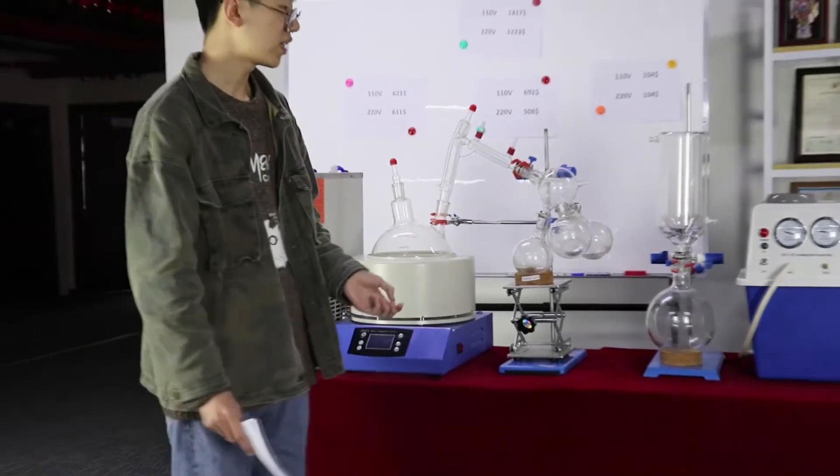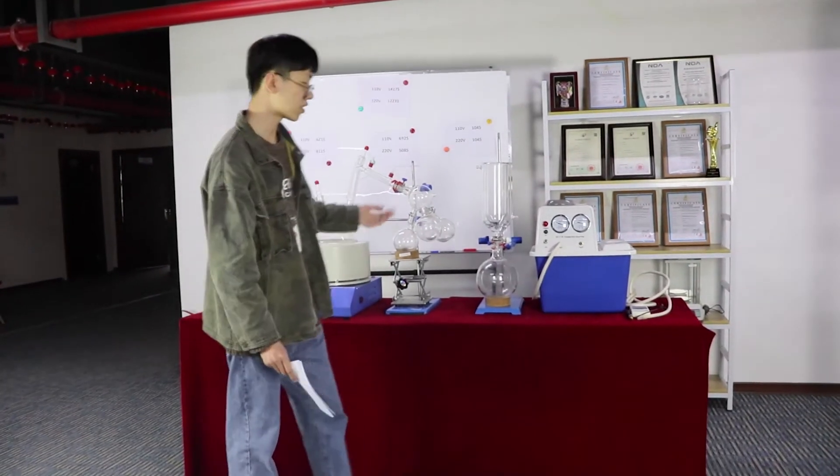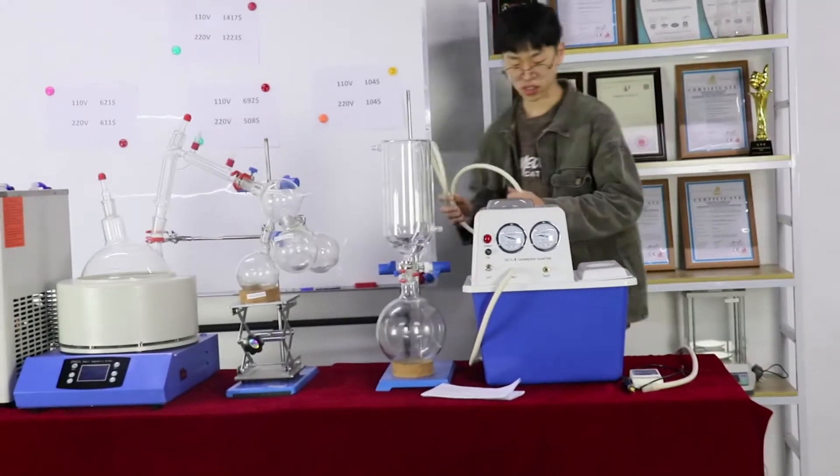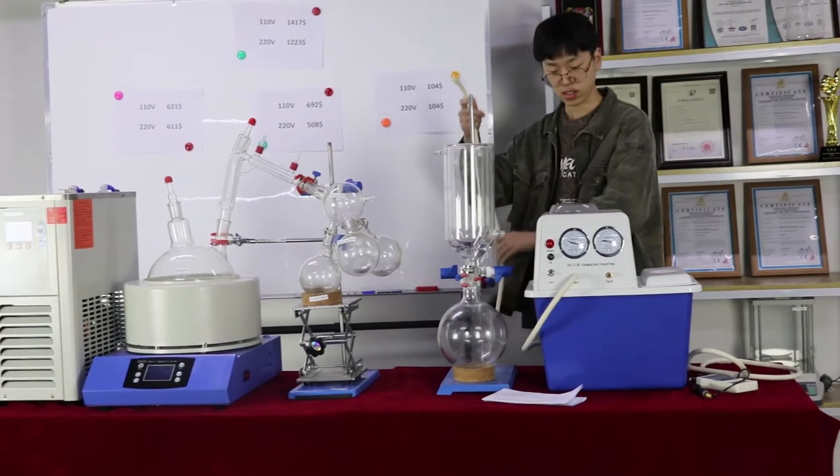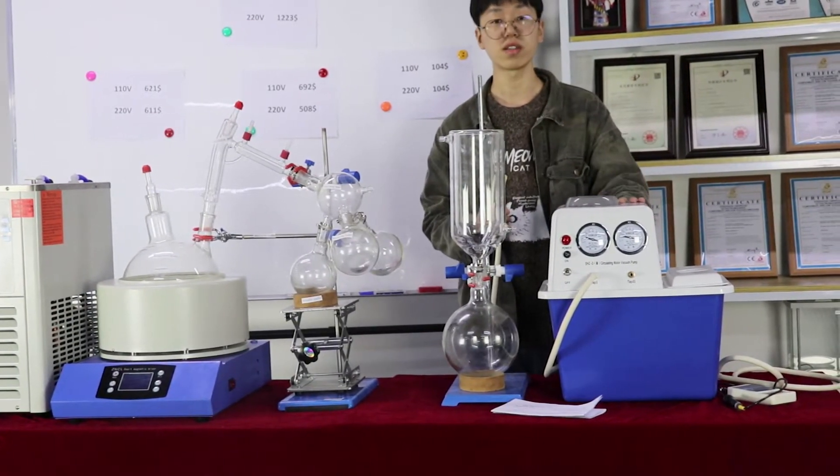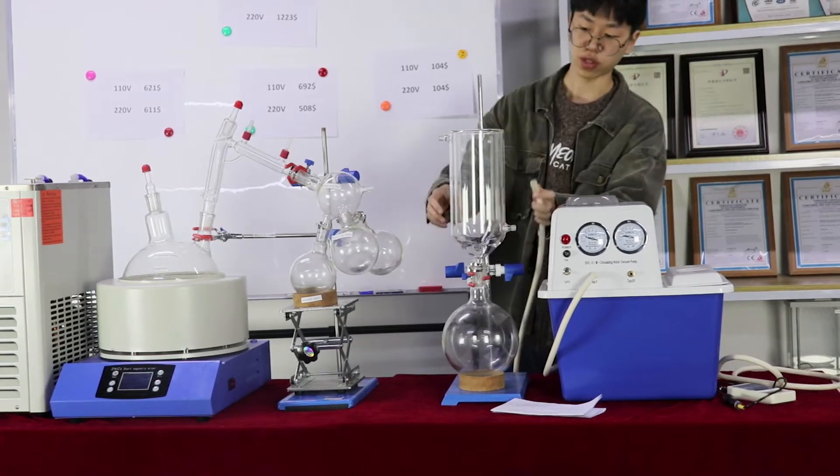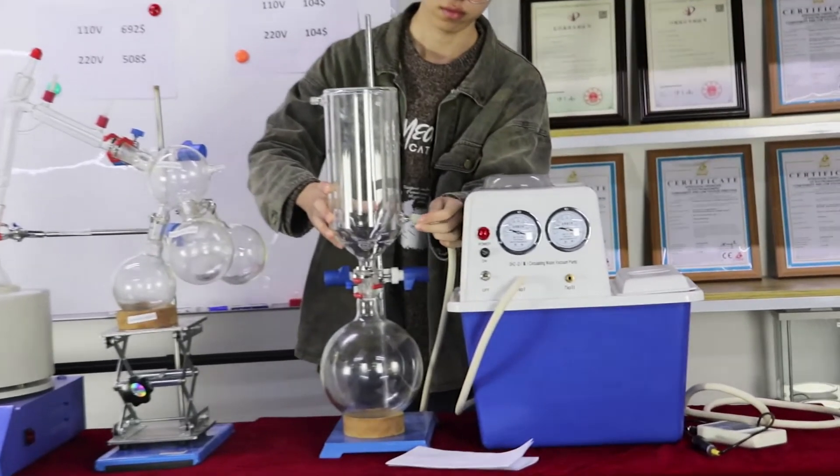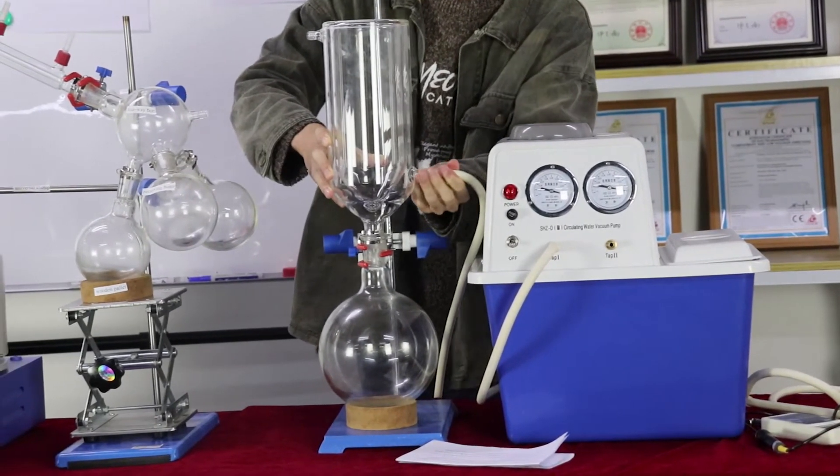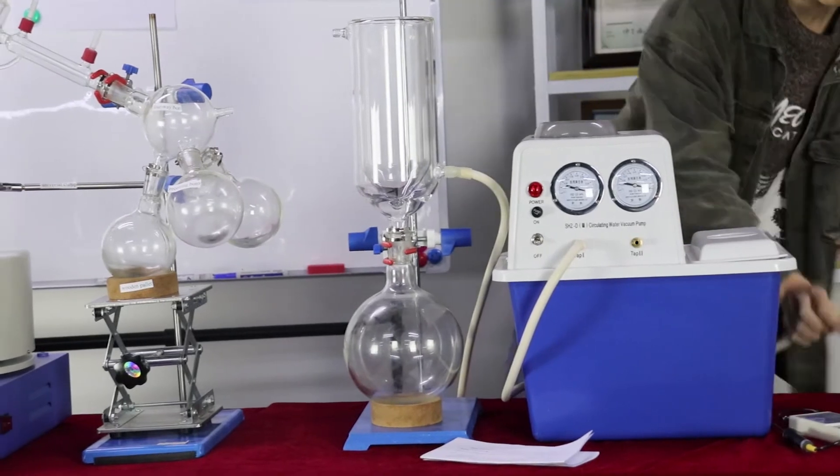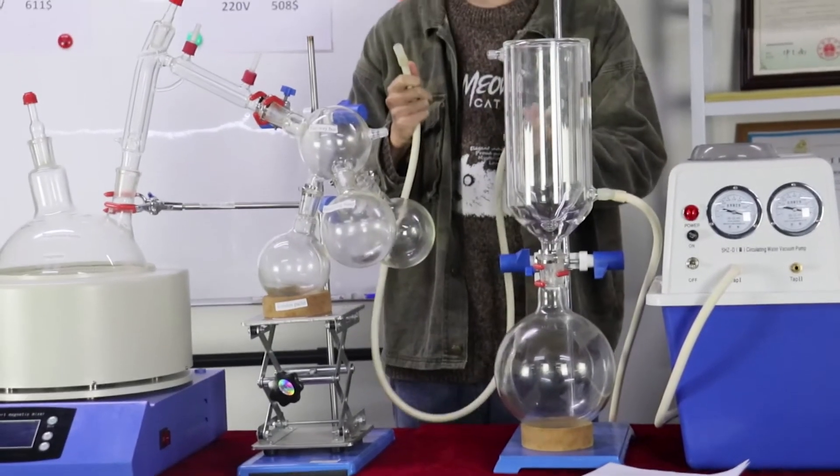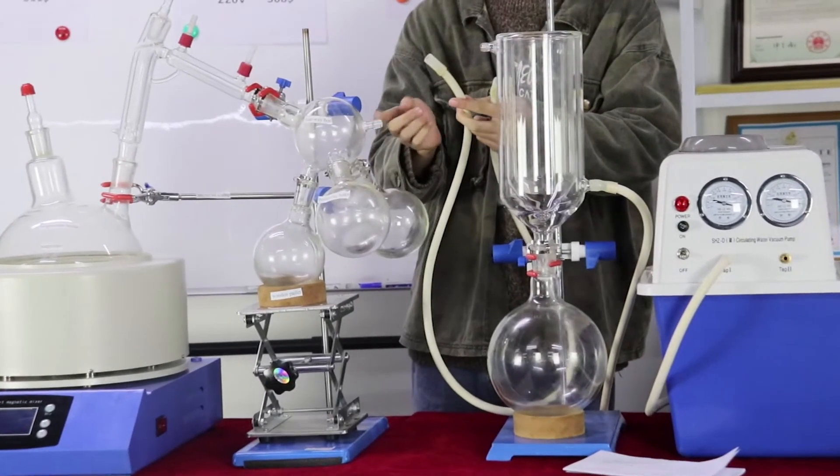Okay, I will connect the system. This is the vacuum tube. First, I need to connect the circulating water vacuum pump to the cold trap. It needs to lock out. Second, I need to connect the cold trap to the 4-way bottle.